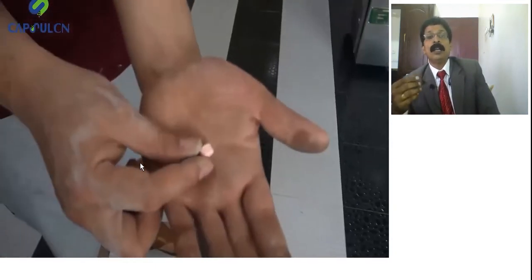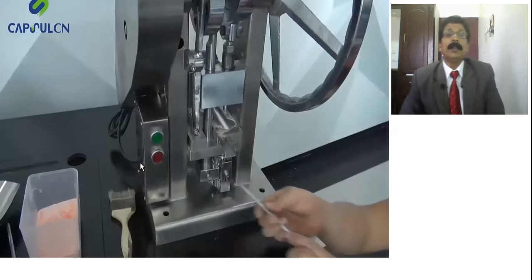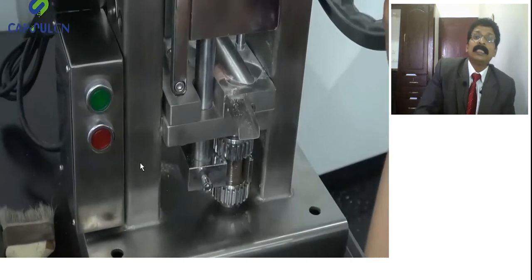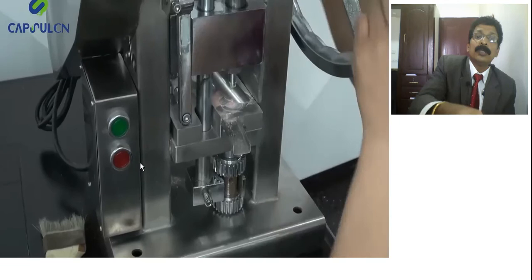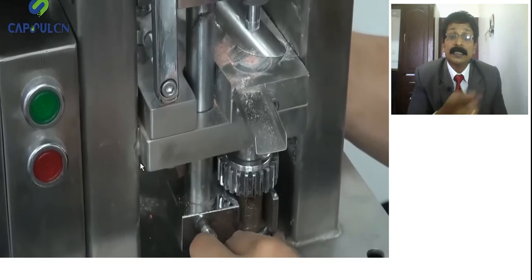There is the Monsanto hardness tester, and you can check the thickness by means of a vernier caliper. He is using the vernier caliper and seeing the thickness, and the thickness is very high, so he wants to adjust the capacity of the die. See, there are two round screws: the top one is for ejection, the lower one is for capacity adjustment, as we saw in the picture also.